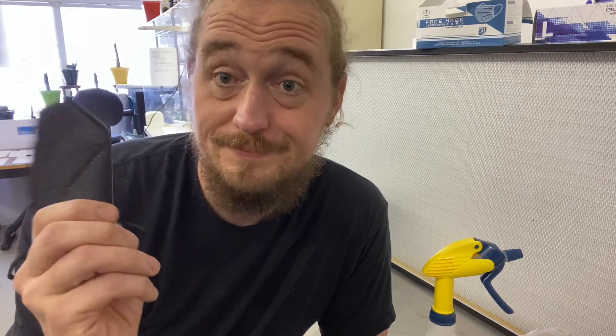Second, you're going to find a mask. Why? I don't really care if you think that the flow hood makes you Iron Man, but as we have learned the hard way here in the shop, we all spit when we talk. This is why COVID is such a thing — water droplets fly out, you get people sick. Guess what? It happens from a flow hood, especially if you're talking. Don't do that.